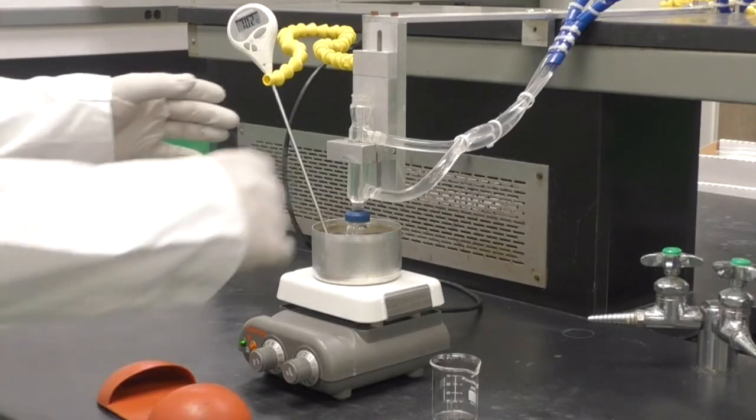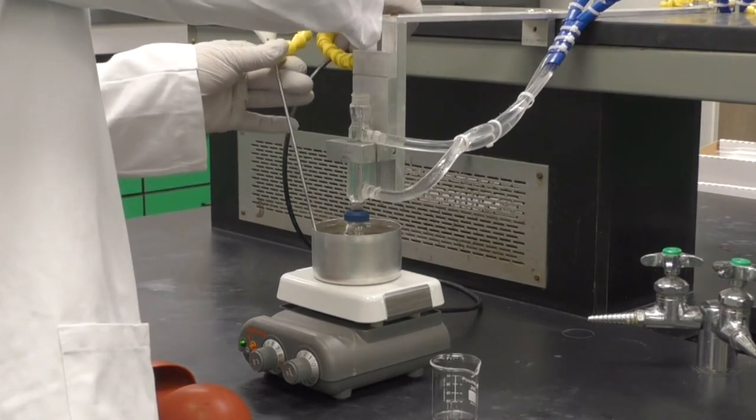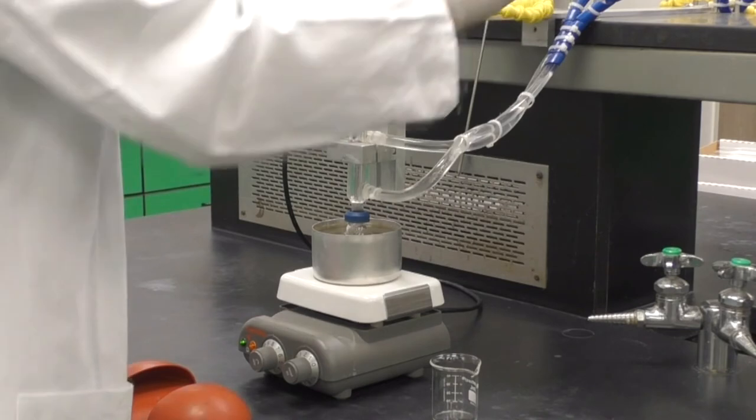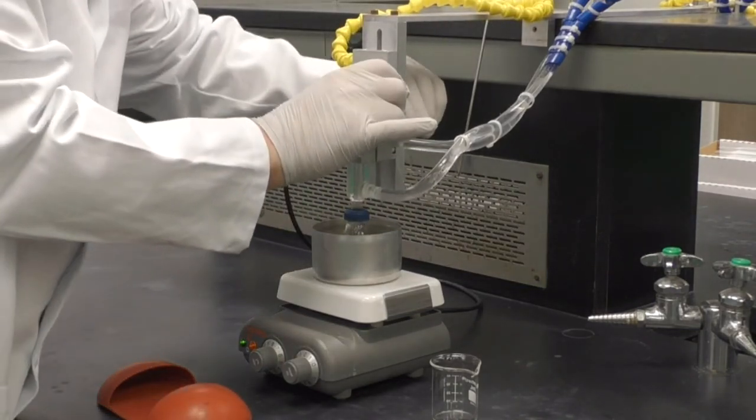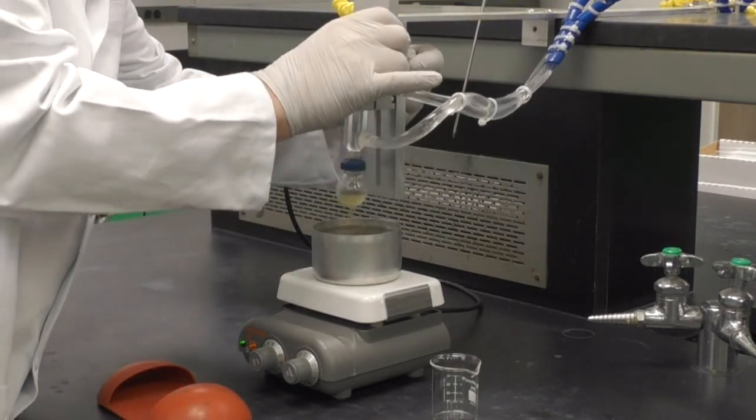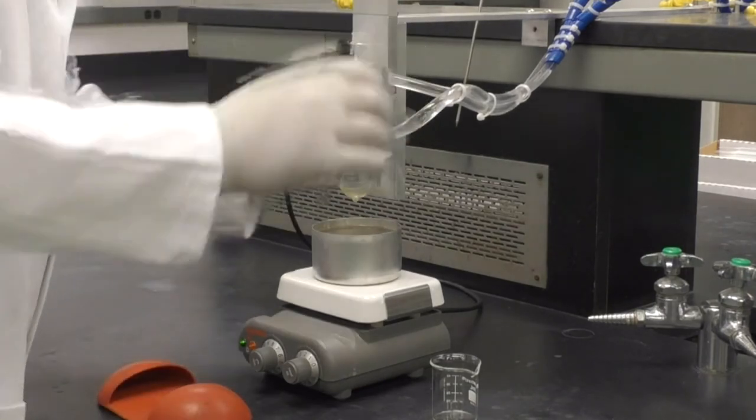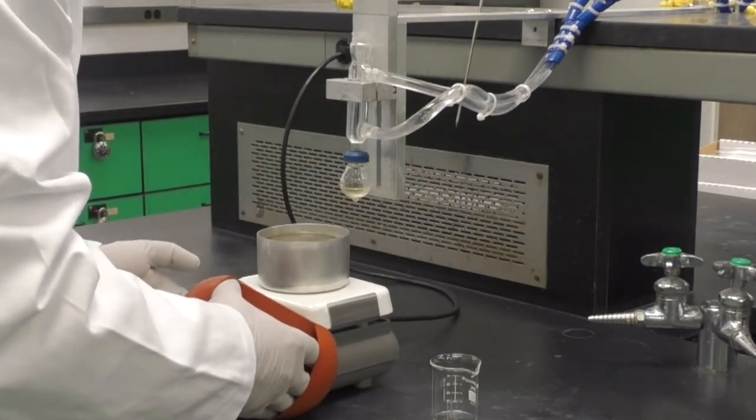After 15 minutes, turn off the heat, remove the thermometer, loosen the wing nut and raise the condenser and flask. Snug the wing nut to hold everything in position. Using hot hands, carefully remove the water bath.